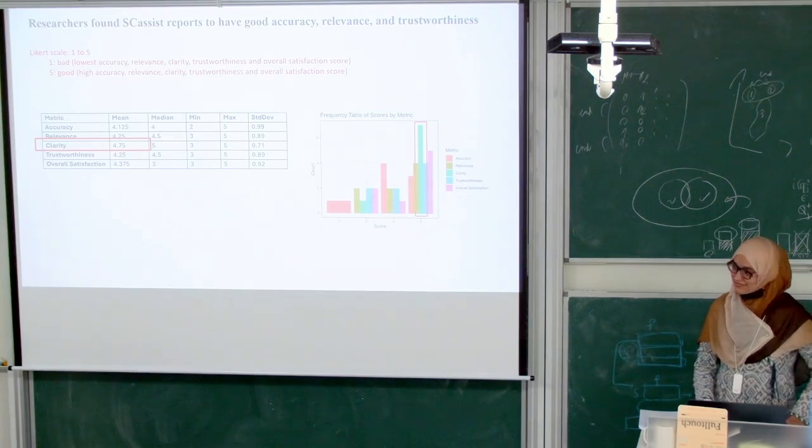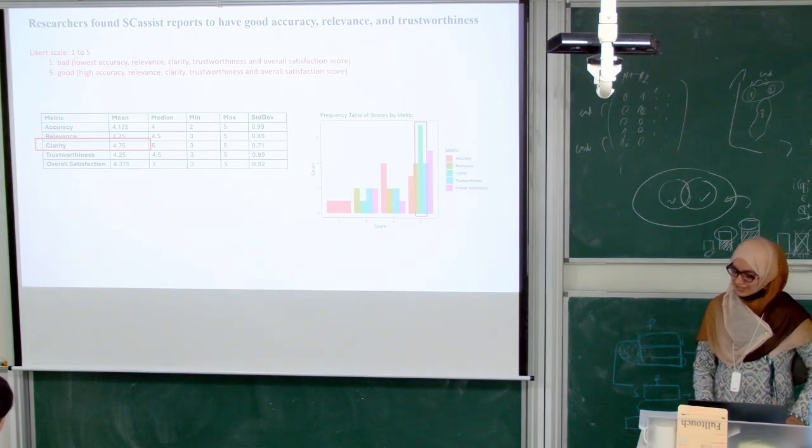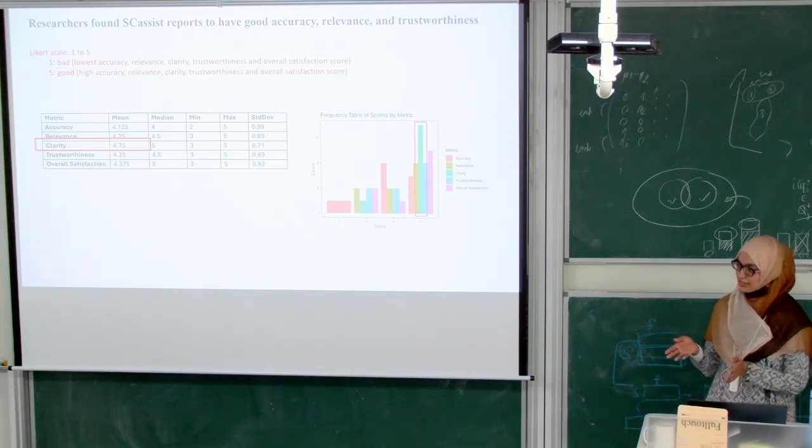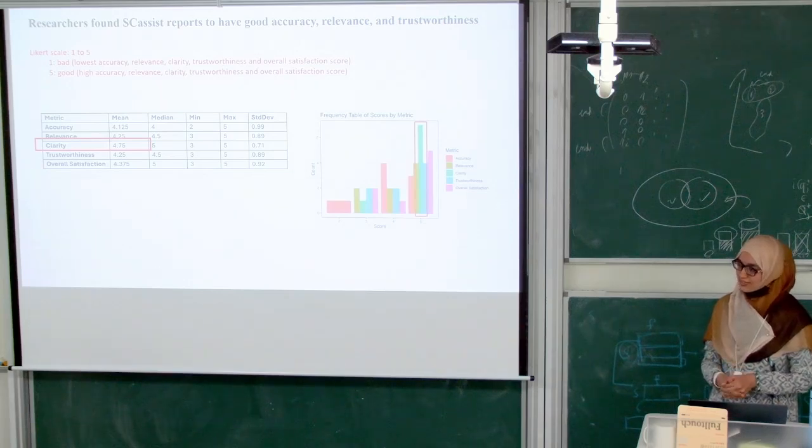But I wonder what is so special about using R. Is it because I don't know R? I think they wanted to automate the Seurat workflow. Yeah, it's an R package, specifically for single cell data analysis.